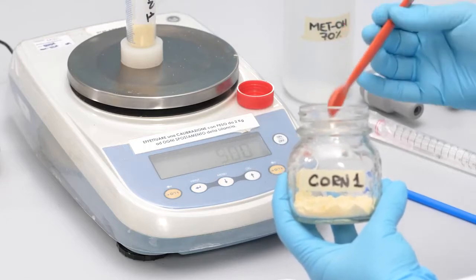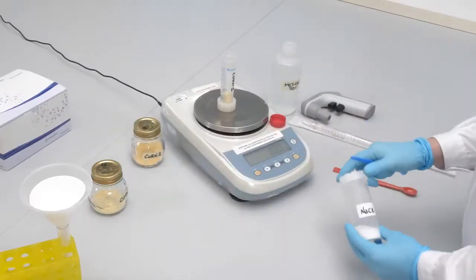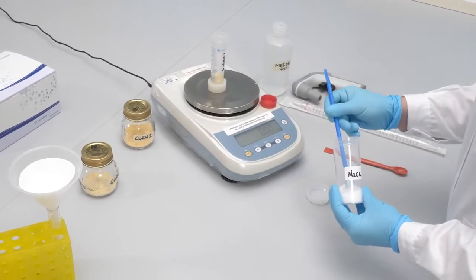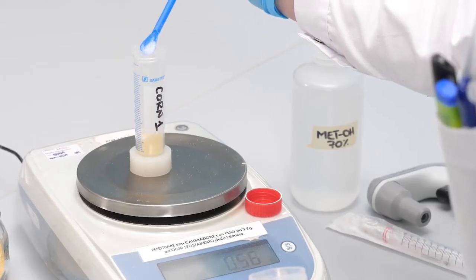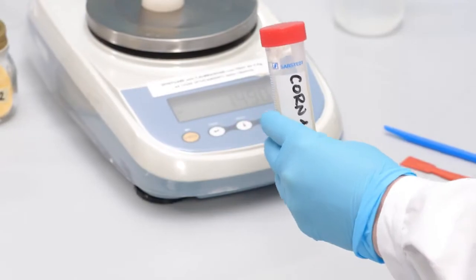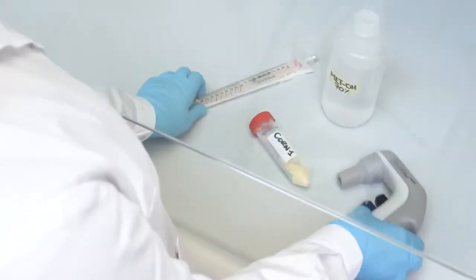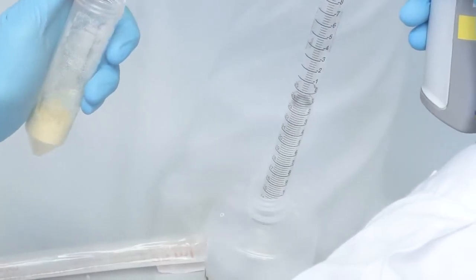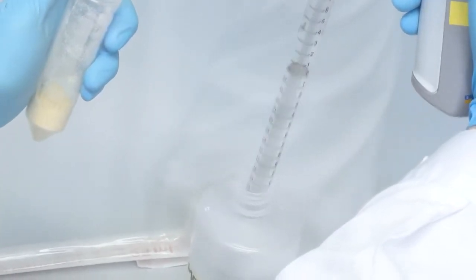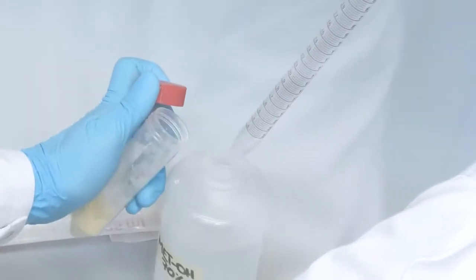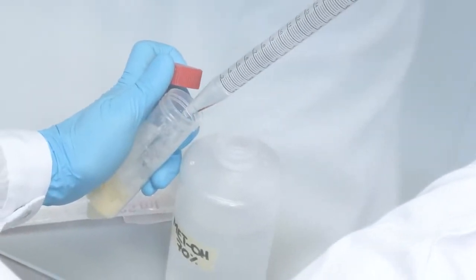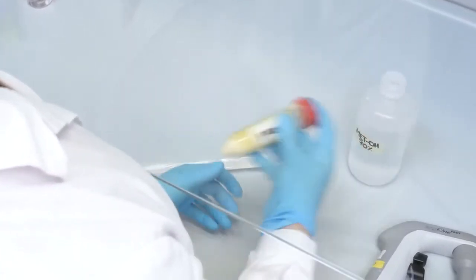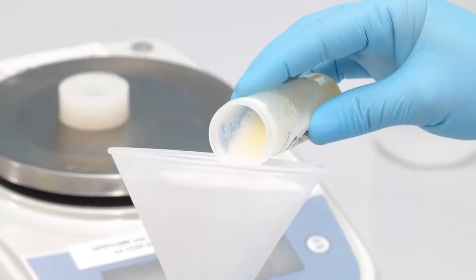For maize analysis, 5 grams of ground material are extracted in 25 milliliters of 70% methanol, 4% sodium chloride for 3 minutes. The sample is then filtered with Whatman 1 filter.